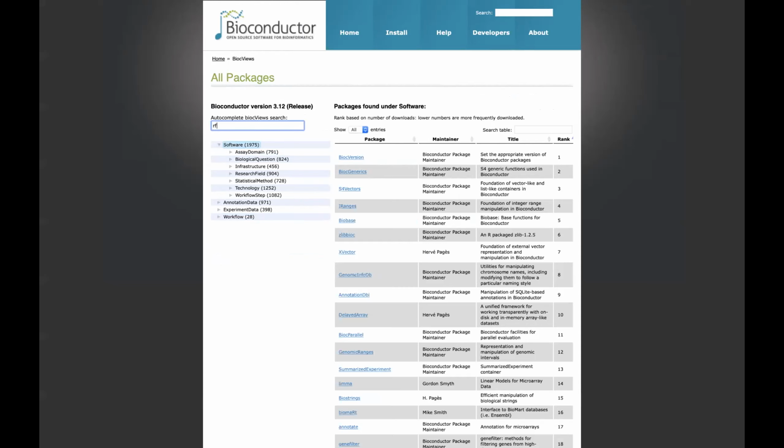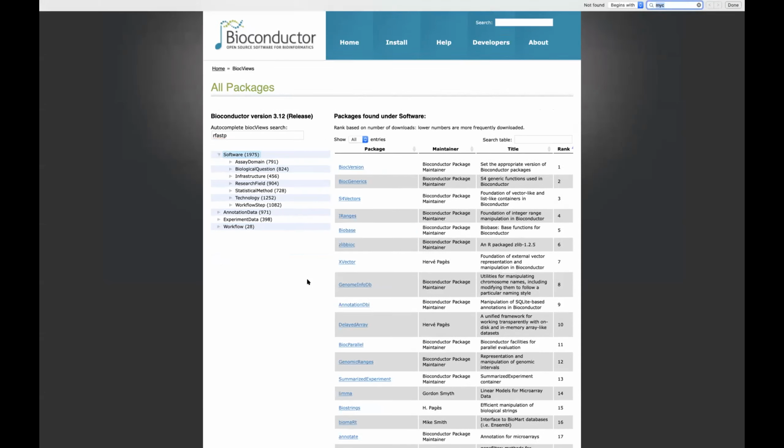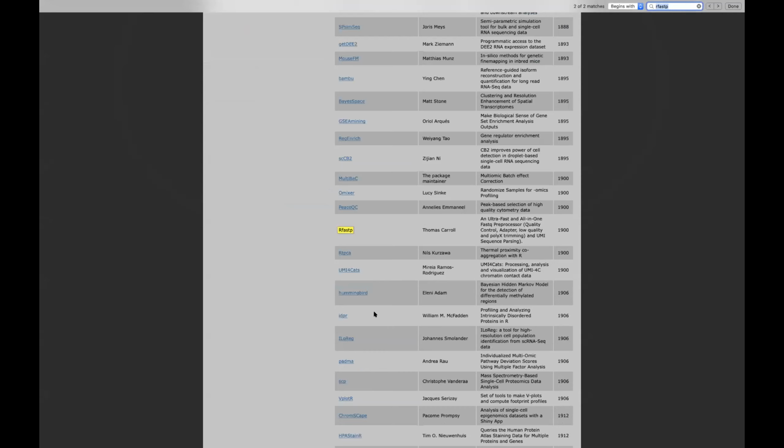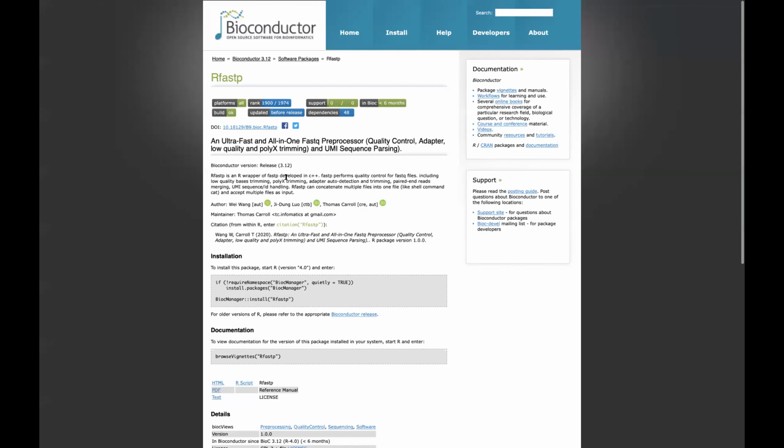I was going to go look for rfastp. So, you know, you could Google this. Or actually, maybe I should just Control F search it. Here it is. It's written by Wei, maintained by me. And we can see it passes all platforms. Not very popular yet. We've only just released it. Builds okay. Importantly, we can see here some instructions on how to install this. We have our manual here, PDF, and we have our HTML description of the vignette here.